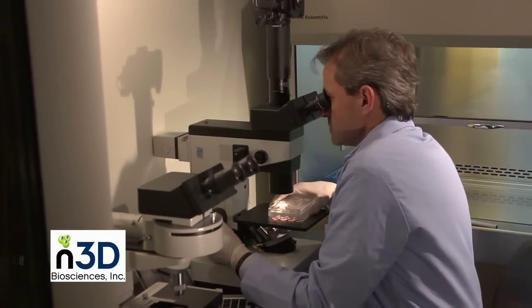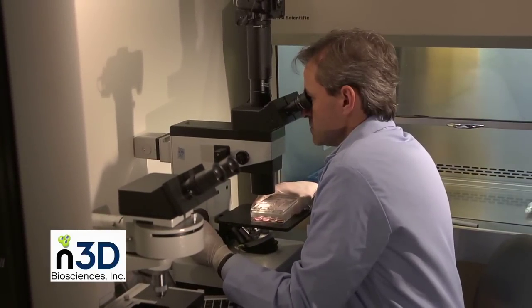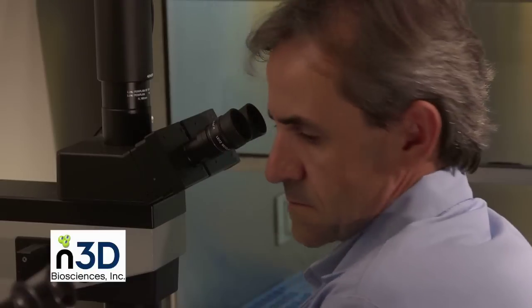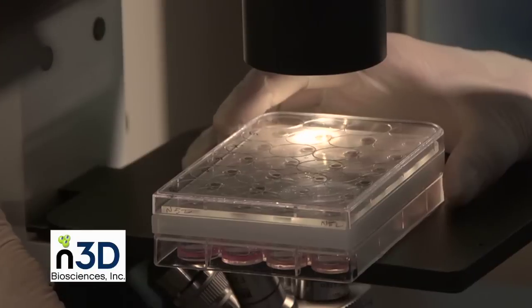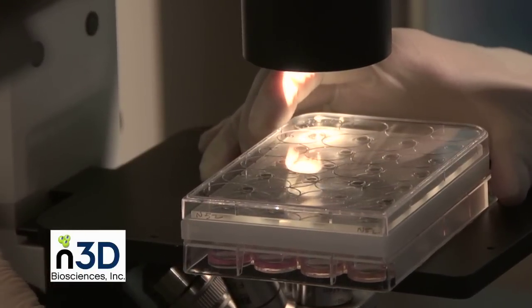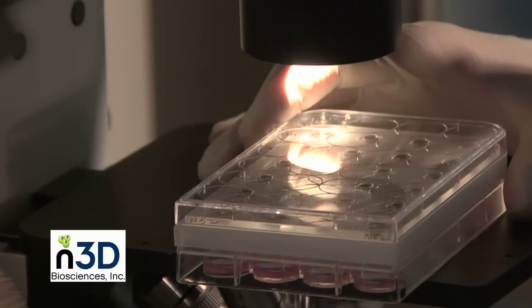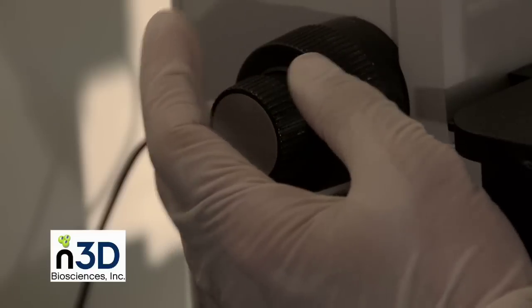Cells can be visualized using a standard inverted optical microscope without removing the magnetic driver and isolation lid. We demonstrate this with the 24-well BioAssembler. Position the 24-well plate with the magnetic drive on the microscope stage and pass light through the opening in the center of the magnet over the well of interest. Using 4, 10, or 20 times magnification, it should be possible to visualize levitating 3D cell cultures.